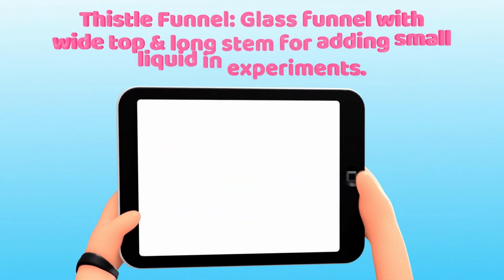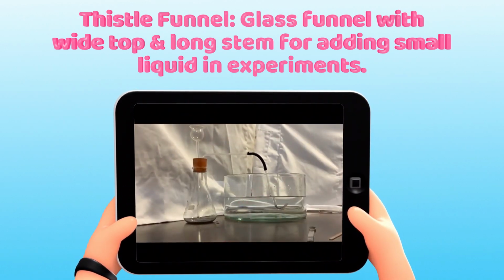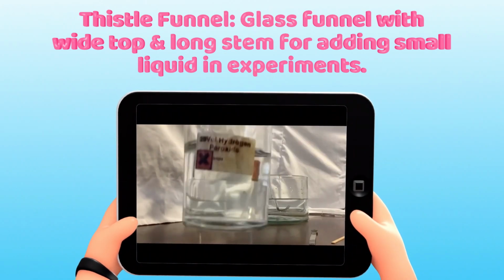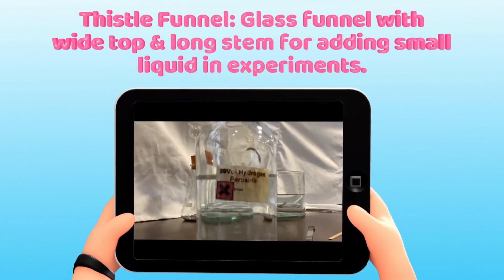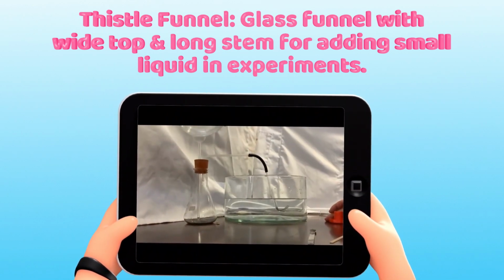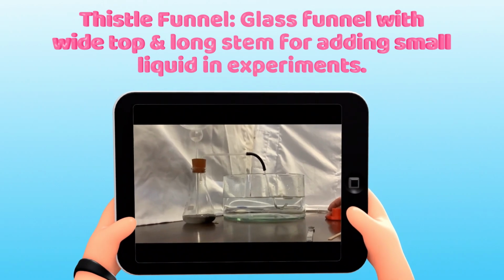Another apparatus is the thistle funnel. This is a glass funnel with a wide top and a long stem for adding small amounts of liquid in experiments. From the picture, you can see the apparatus at the top. That is what we call a thistle funnel, and that's how it is used.